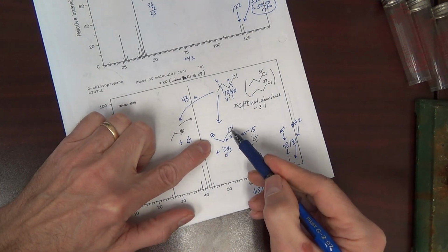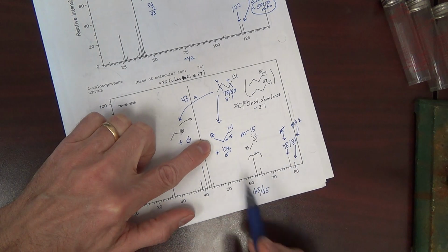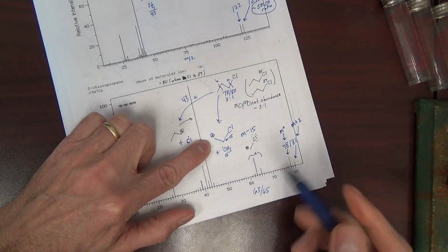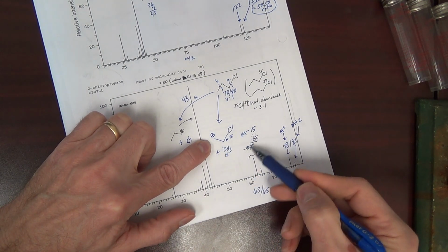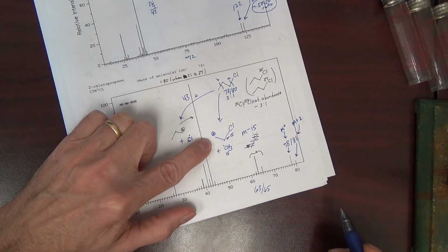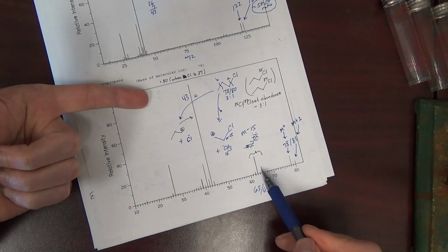But since it's chlorine, when we add it up, it's either going to be 35 or 37. This should add up to 63 and 65. And so this looks like another way. And what I had drawn here is an error, because if you add up what I've got drawn there, that does not equal 63 or 65. Two different pathways we're looking at.